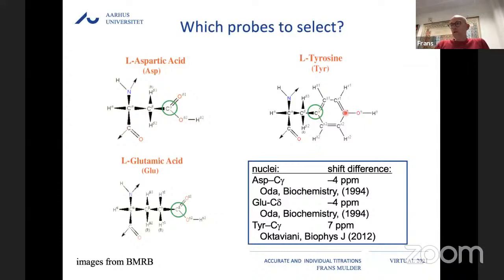However, if you're interested in the orientation of individual side chains, residual dipolar couplings are very sensitive to that. Rather than trying to solve the whole structure, they give you exquisitely sensitive data about the orientation of individual bonds in the structure. That might be a good combination.